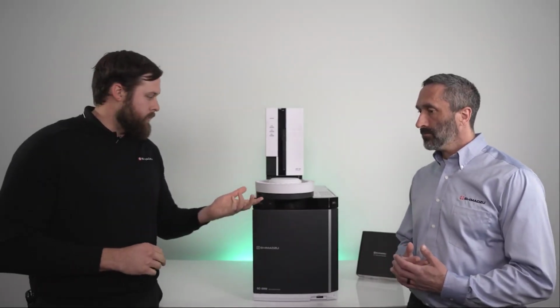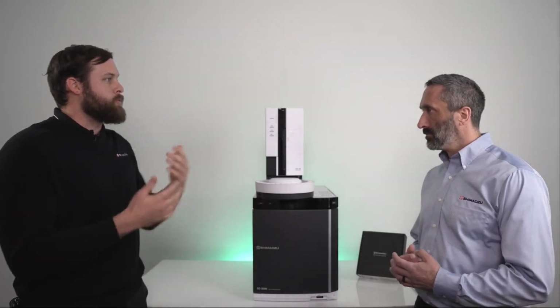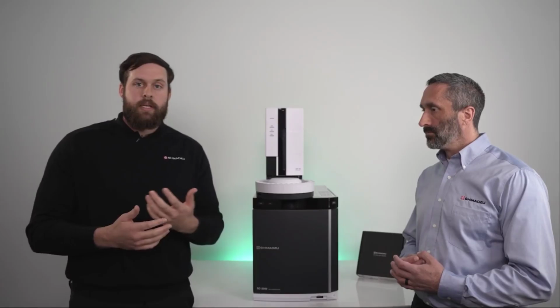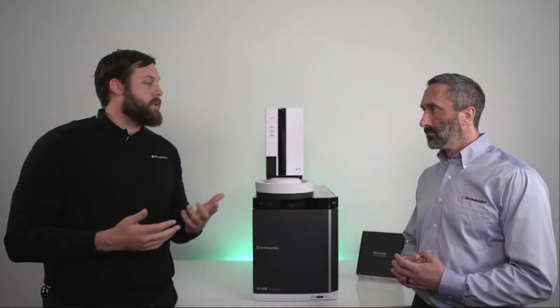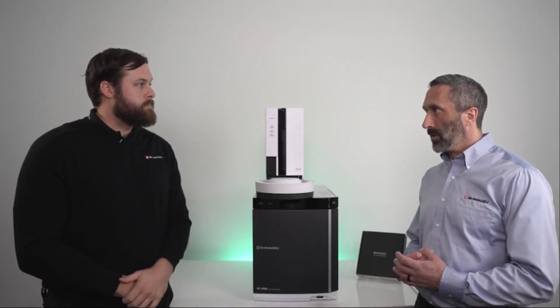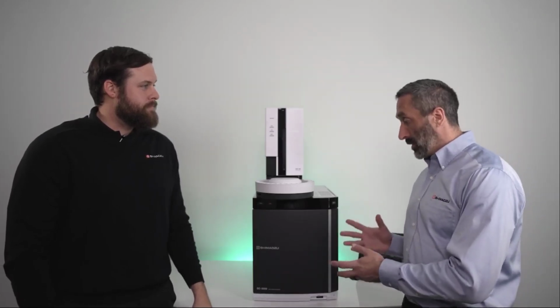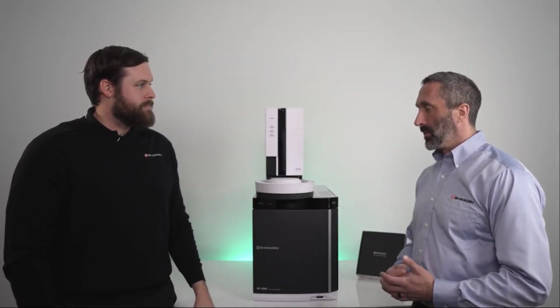Yeah, I think, obviously we focused a lot on the physical aspect, but we really wanted to make the user connection as simple as possible so that new users or users of varying experience levels could sit down in front of the instrument and feel comfortable with it. That's great. So, yeah, I'm used to seeing a touch screen or some display on the instrument itself.